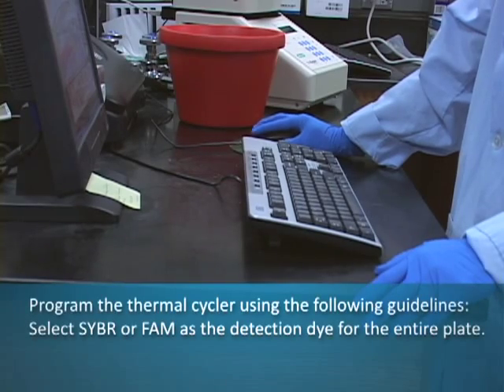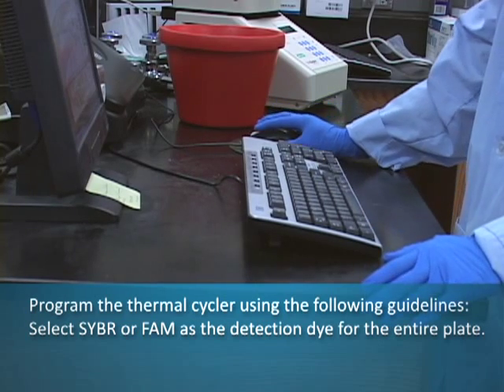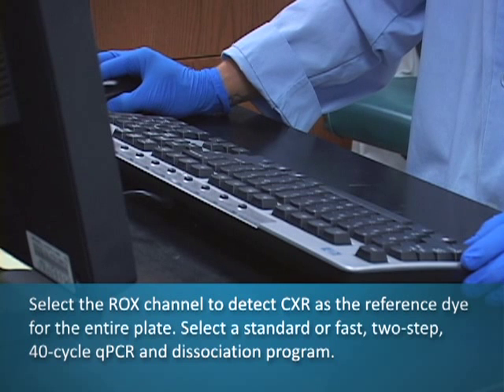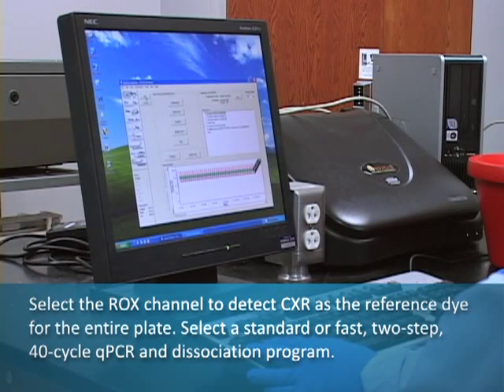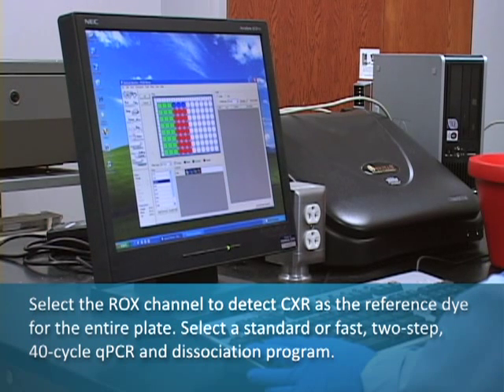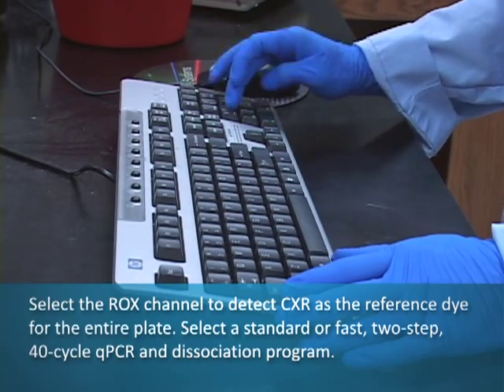Program the thermal cycler using the manufacturer's instructions with the following guidelines. Select SYBR or FAM as the detection dye for the entire plate. Select the ROX channel to detect CXR as the reference dye for the entire plate. Select a standard or fast, two-step, 40-cycle qPCR and dissociation program.